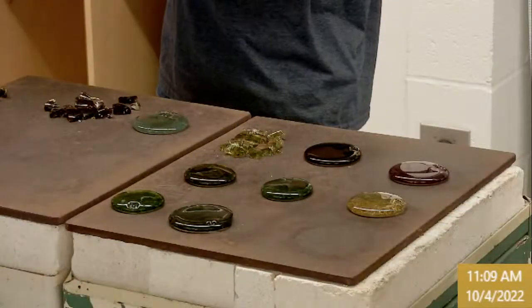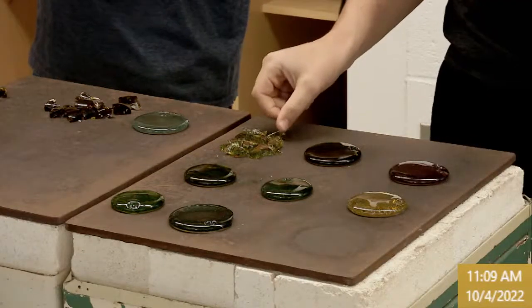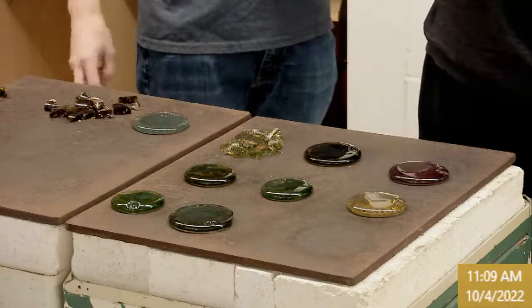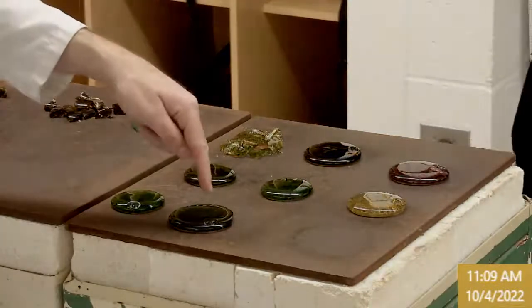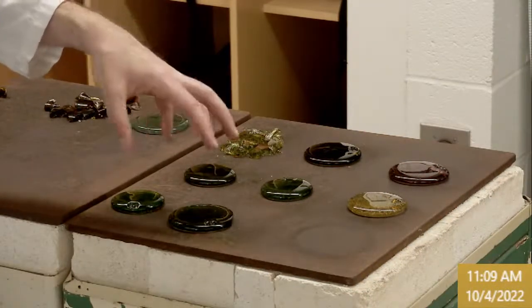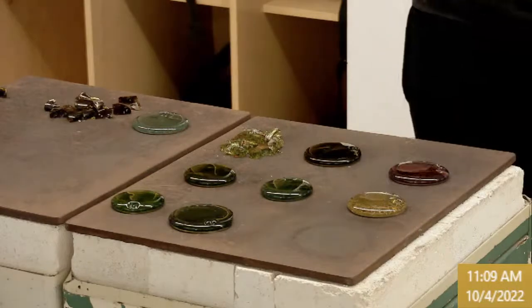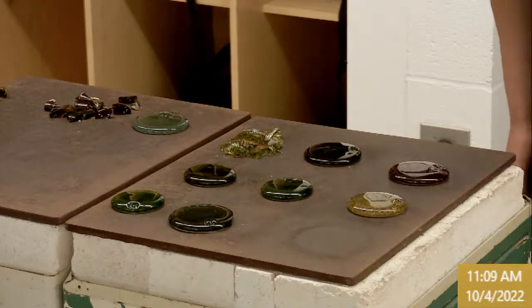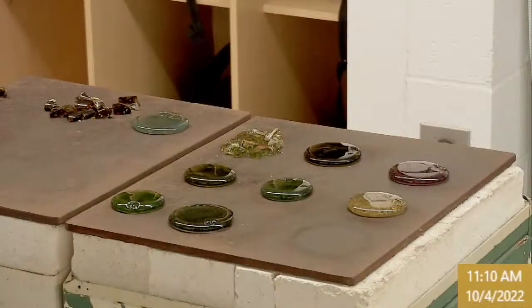Come up with a way to benchmark it to three, low, medium, high, or benchmark it to 10, maybe. High viscosity spreads less. So our lowest viscosity was probably this one that did a side shatter, because that had the borate, so that one poured the easiest, and the one that was the smallest or tightest diameter was probably the highest viscosity. So we've actually got a couple of them. High viscosity spreads less. Right, it's thick, so when it hits the surface, it stays in a taller stack, it doesn't spread out as much. The lower viscosity spreads and flattens. This is the right way to use it.